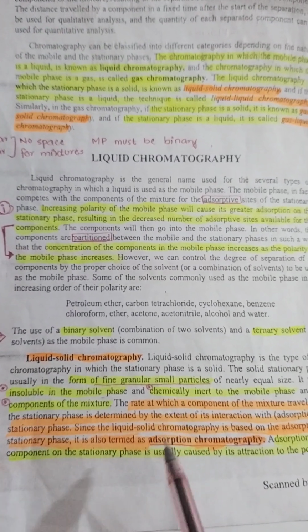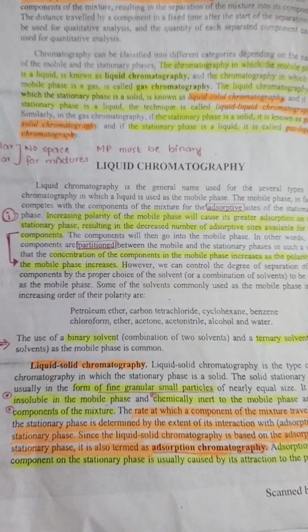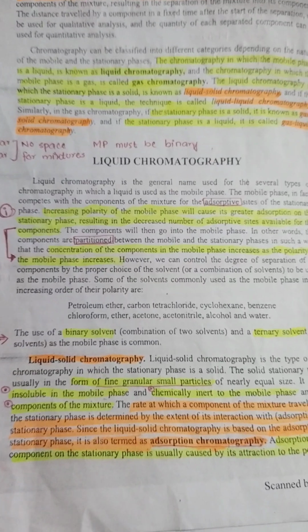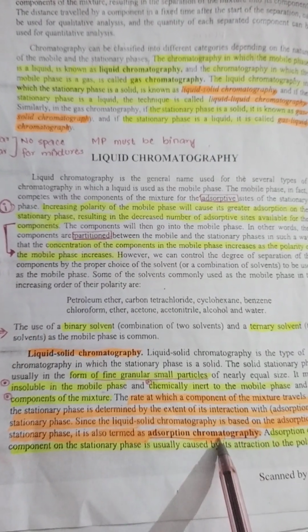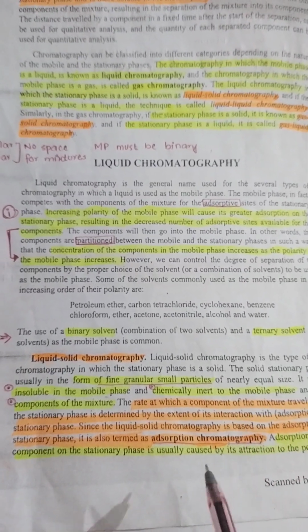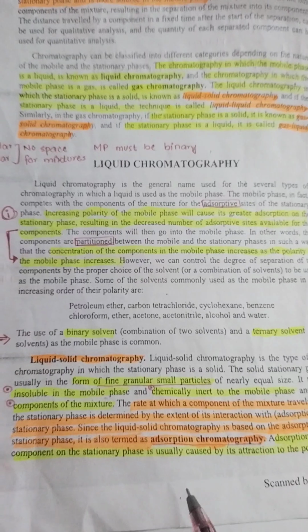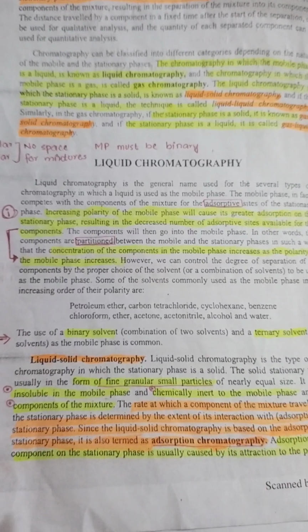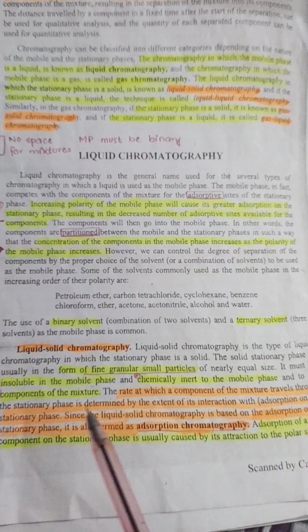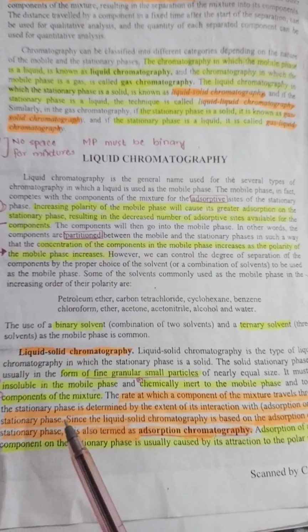Now, why is it called adsorption chromatography? Because the same phenomenon of "like dissolves like" is applied here. Our stationary phase is polar. If our component is polar, it is tightly bound to the stationary phase. The rate at which a component of the mixture travels through the stationary phase is determined by the extent of its attraction to the stationary phase.